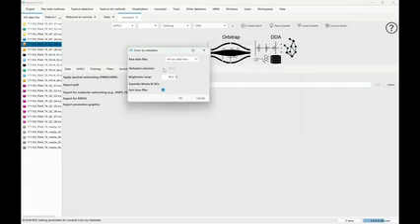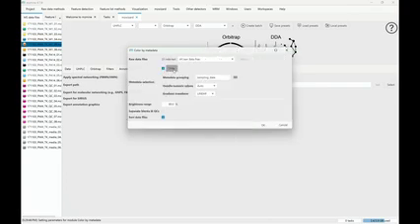I can click on this box, I can show the parameters, and then in here, we have either sampling date, or we can type in condition, and if I start just writing condition, it's going to show that we loaded some metadata and a column with condition. You can always check, there's like this little button, sometimes, there's a button, just click it.